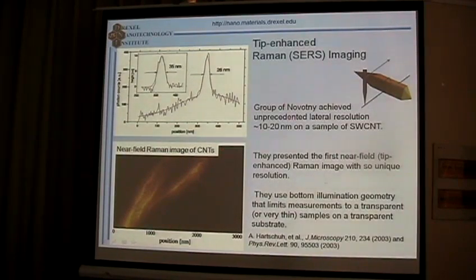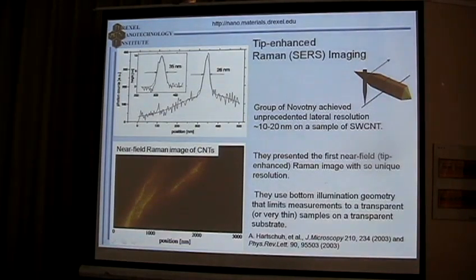And this was done by the Novotny group by scanning a surface enhanced Raman tip over carbon nanotubes lying on the surface and illuminated from the bottom here.